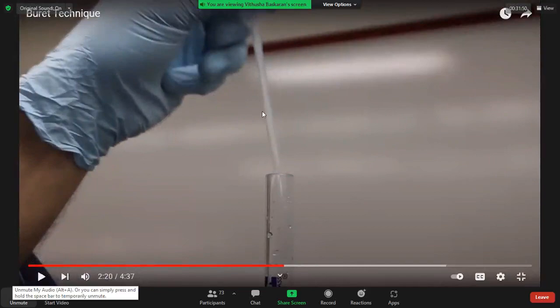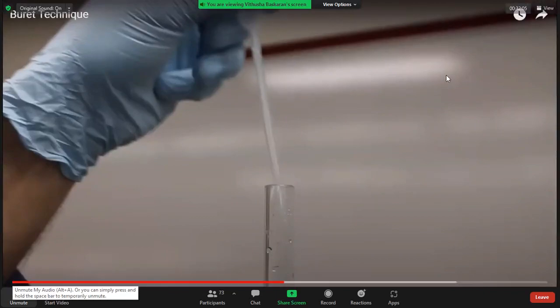Why are you using this dropper for rinsing purpose? Already you have rinsed using a funnel. Then again, why are you using this dropper? To clean the upper part of the Buret, which is closed when the funnel is inside. Okay, yes, to clean the walls of the Buret, we have to use the dropper. Okay.